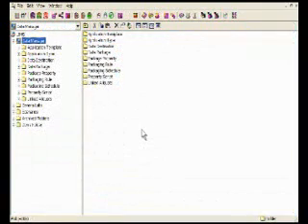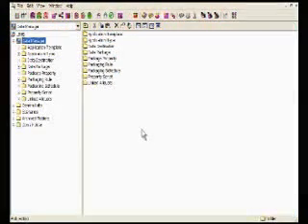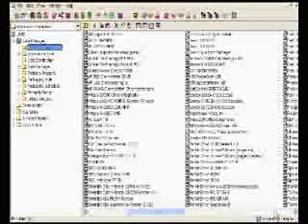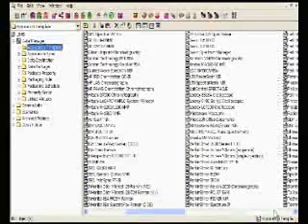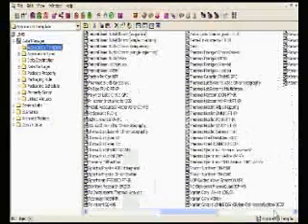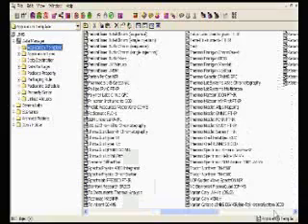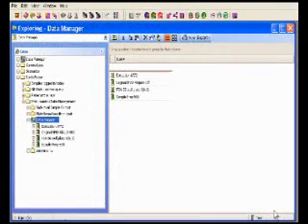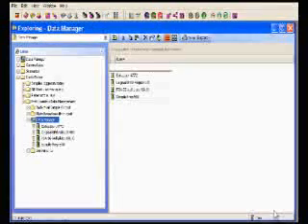Instrument integration is key to increasing laboratory automation and efficiency with the LIMS. However, only 40% of instruments are linked to a LIMS, due to the complexity and diversity of instrument formats and interfaces. It's easy with Nautilus' built-in data manager tool that captures data from a range of laboratory instruments in the LIMS.